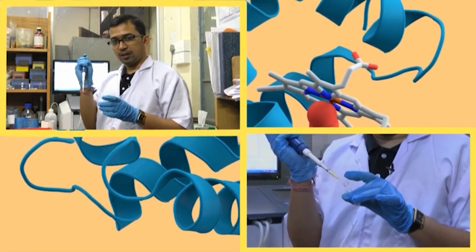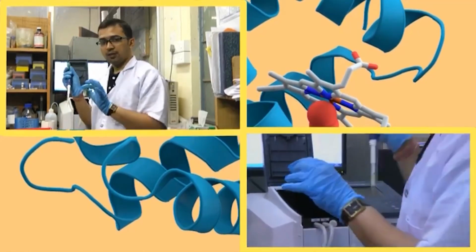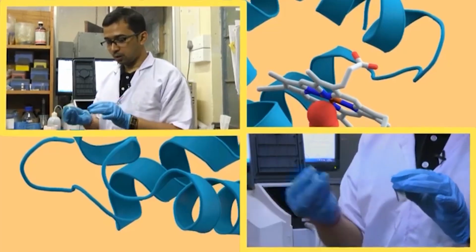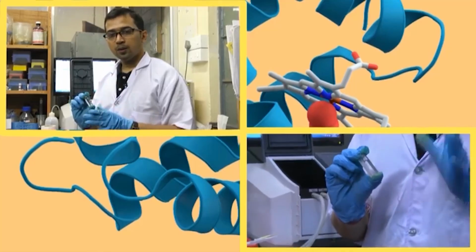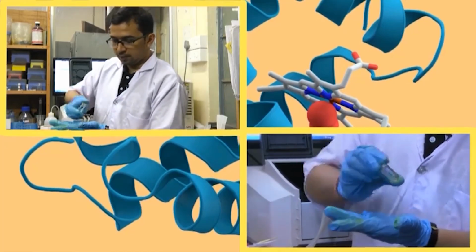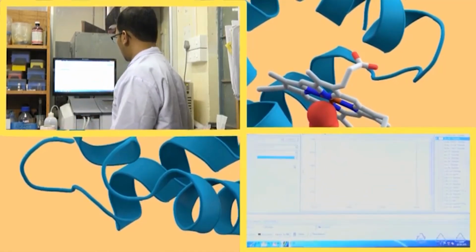Here we are taking 10 microliter of HSA using a clean micro tip. Here we have gallic acid and I will be adding HSA here, mixing it, and again I am taking this cap. Now, this cap has been cleaned. The cap which we used for curcumin, it is better to use a different cap, or if you use the same cap, make sure to clean it properly. So, now I am mixing it, transferring it here and doing auto 0.